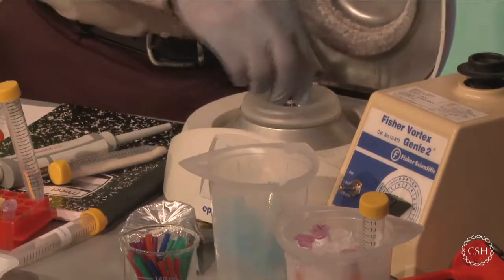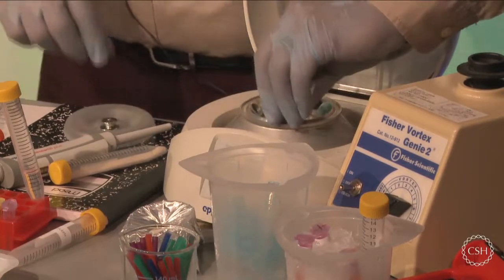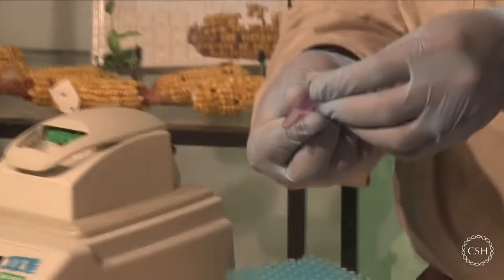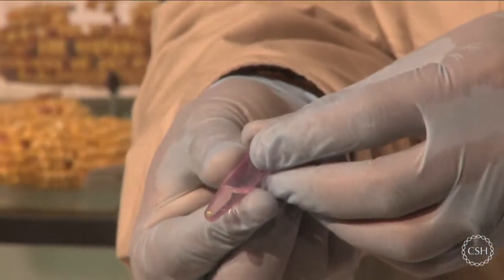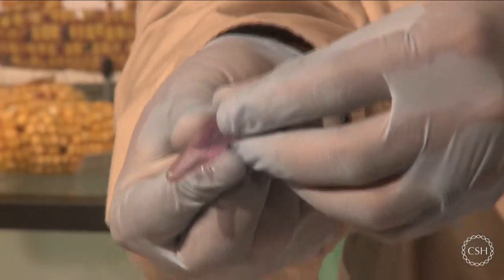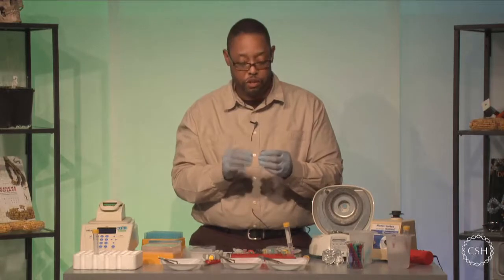Okay, so now once this is complete, you should see once again that there actually is a pellet at the bottom of the test tube. And here's my plant pellet. You can see that it's still a little green. It's pulling over some stuff. But we want to make sure we continuously see a silica resin pellet as we physically go through the stages.